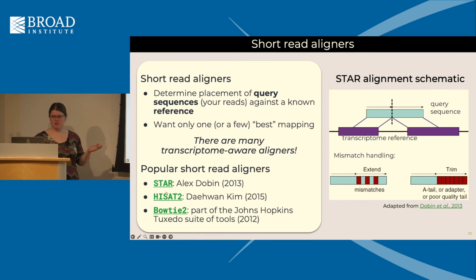I'm mentioning some of the popular ones. You've got STAR, HiSat2, Bowtie. I think STAR is really great. From the time that it was developed about 11 years ago, it's a really fantastic tool. And the other thing that I always advocate when you're going after aligners, there are humans behind this process. So you want to pick tools, not just aligners, but tools in general, where you have people that are dedicated to maintaining those tools. That will make your life easier.